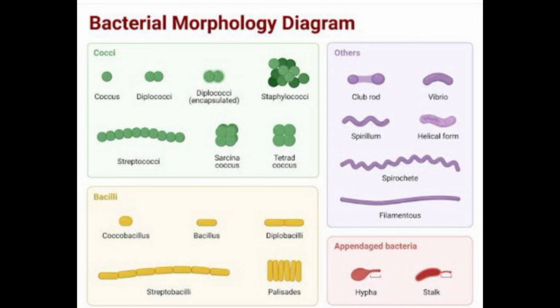Differential Gram staining gives two broad groups, Gram positive and Gram negative. Gram positive bacteria resist decolorization and retain the color of the primary stain, that is violet. Gram negative bacteria are decolorized by acetone alcohol and therefore take the counterstain and appear red. Acid-fast stain is the Ziehl-Neelsen stain. The acid-fast stain was discovered by Ehrlich and subsequently modified by Ziehl and Neelsen.